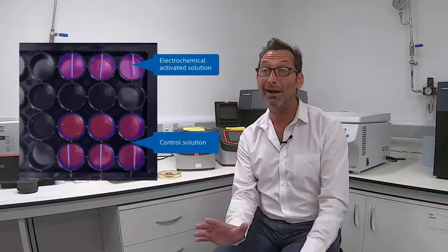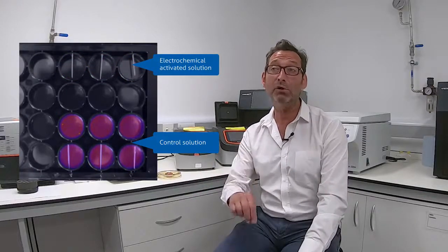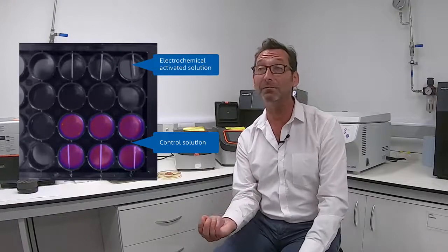And what we're able to do with bioluminescence is to demonstrate this very visually. I explained earlier about bacteria glowing and being alive. Well, in our facility we can treat those bioluminescent bacteria with a disinfectant such as electrochemically activated solutions, and we can actually visually watch the lights go out, which would imply that the bacteria is either metabolically inactive or hopefully dead.